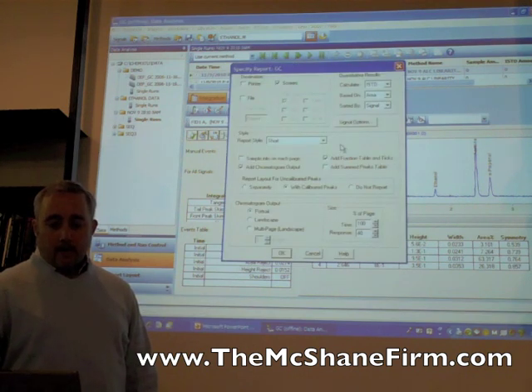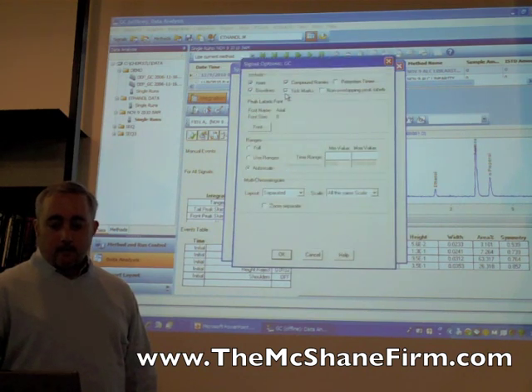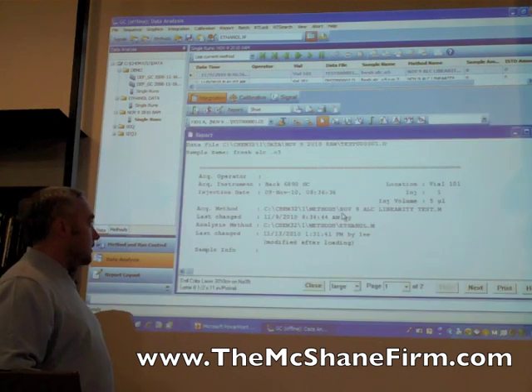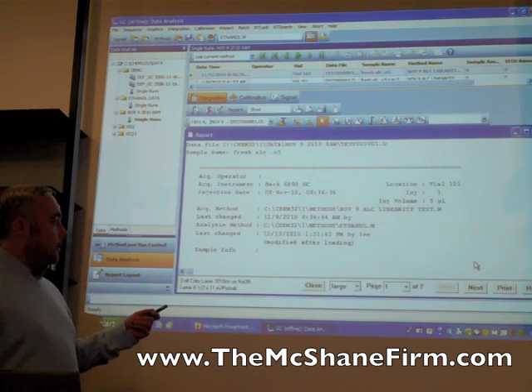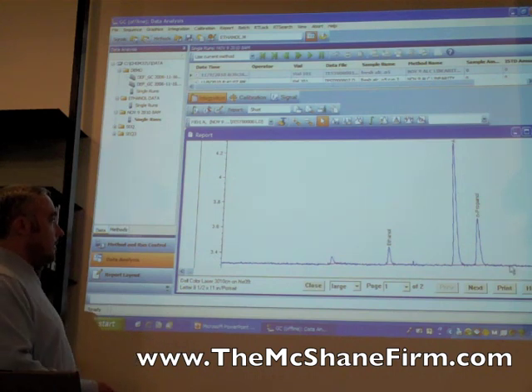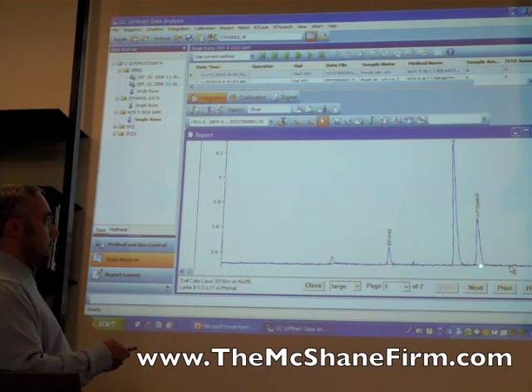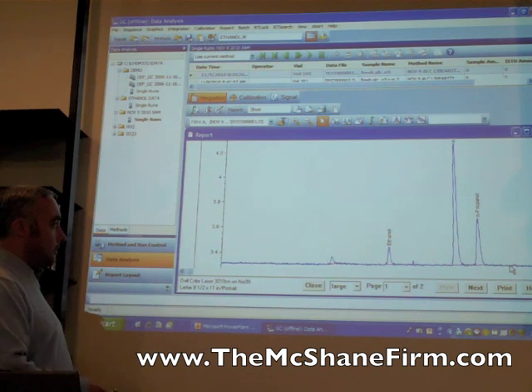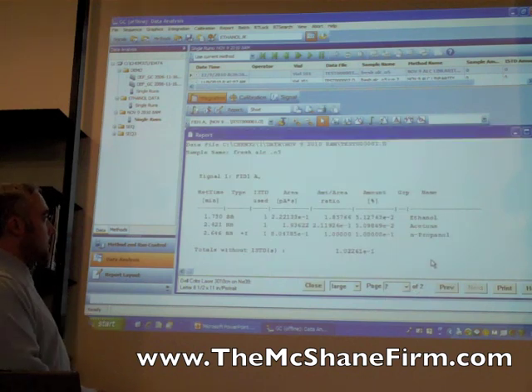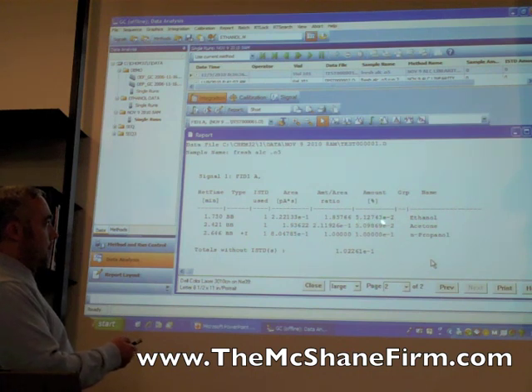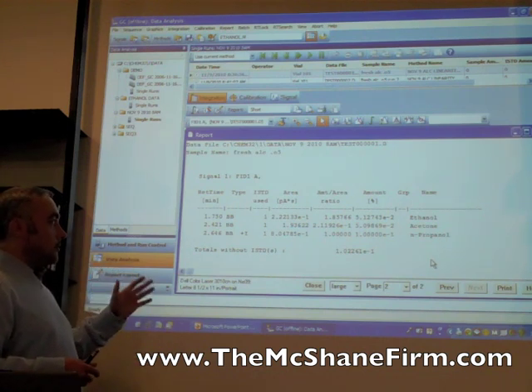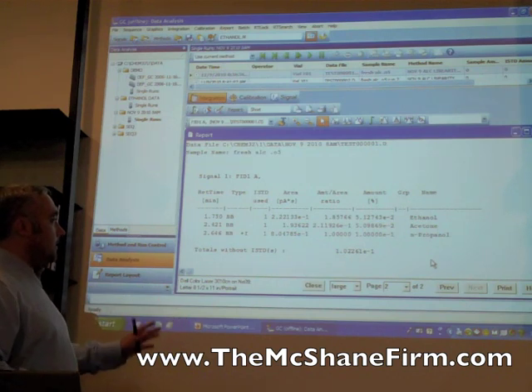We want to be good scientists first, and then I'll show you how to be an evil scientist. What we have here is the first unmanipulated data. This is the chromatogram you would get if you did the auto-integrate — meaning the machine follows its method the way it's validated to do. We're labeling the ethanol, acetone, and n-propanol. The red marks are integration marks showing where the computer has calculated the baseline to be. The quantification shows ethanol at 5.12e-2, which means 0.0512 — exactly what we'd expect from a certified reference material.